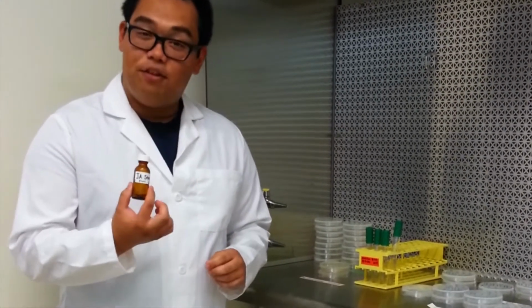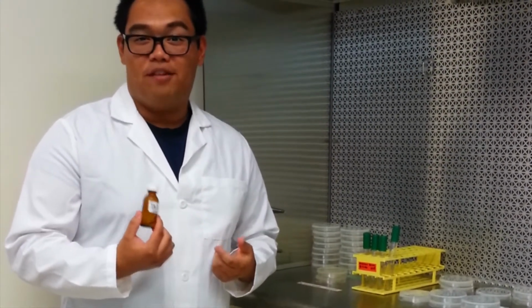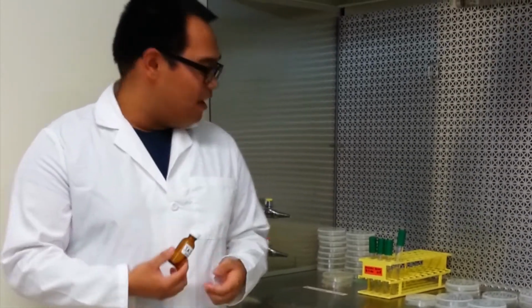This is the micro prep room. This is where I make my jasmonic acid, which is one of the treatments I used on my bacteria. This is also where we make the plates, which is what we grow the Bacillus subtilis on, and also where we make some of the solutions and media that we grow the other bacteria on. And we have a cool little oven that we use to sterilize our bacteria, so we make sure everything's safe and all good to go.